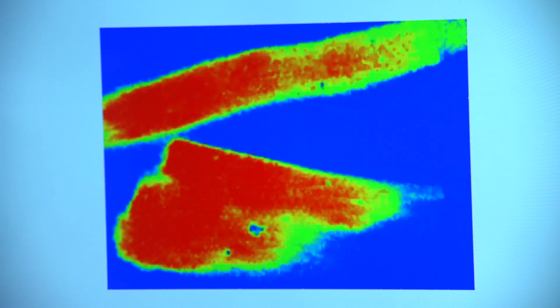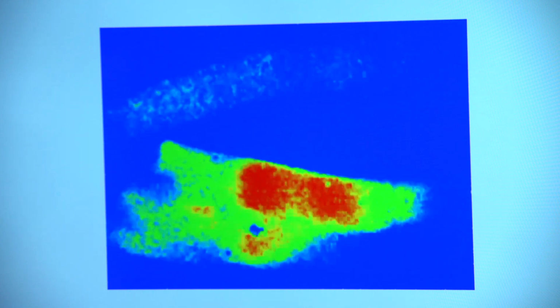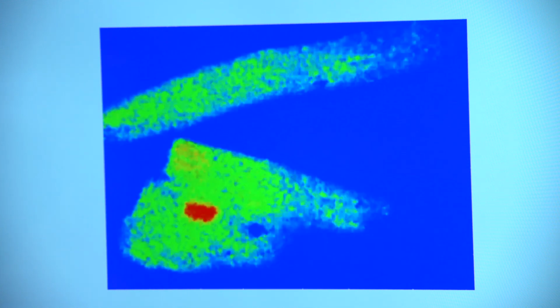Okay. And they're beating away, and the top cell stays faithful to the rhythm that we want. There's an electrical signal imposed on it, but the bottom cell starts to do its own thing. And you can see it started to skip beats. And eventually, about now, it stops beating at all. And it stops showing those calcium signals.